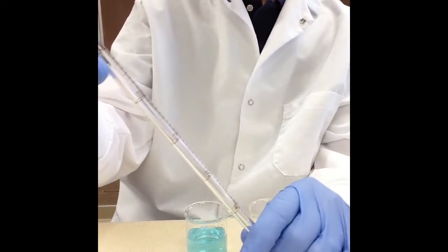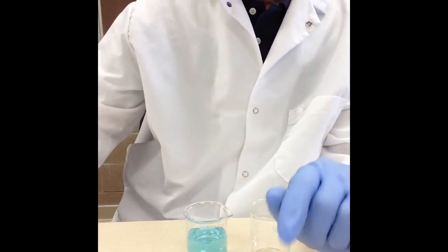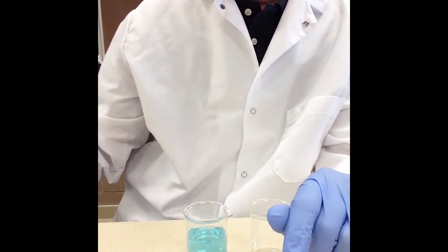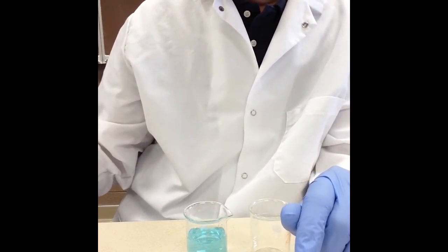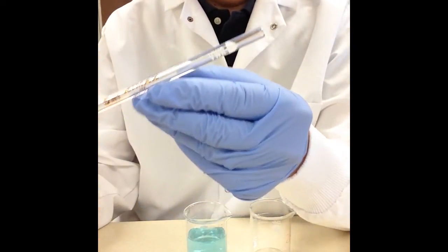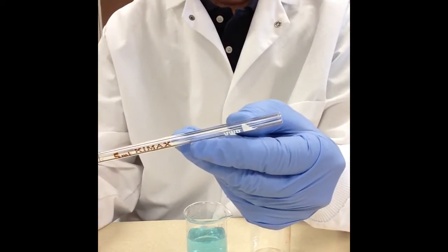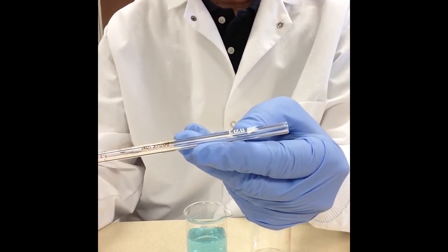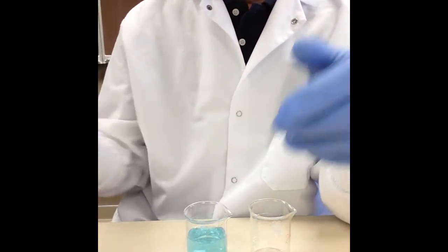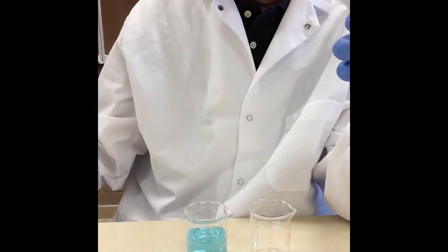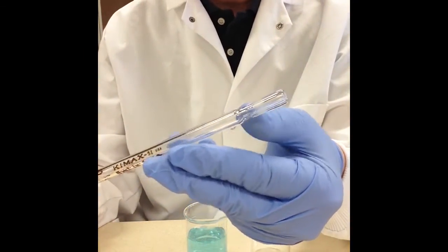Just a couple of things about the markings on these pipettes. I'm not going to talk about all of them really, I just want to talk about a couple of them. On the top of pipettes you're going to find different shapes and colors and these shapes tell us information about the pipette, for example size.